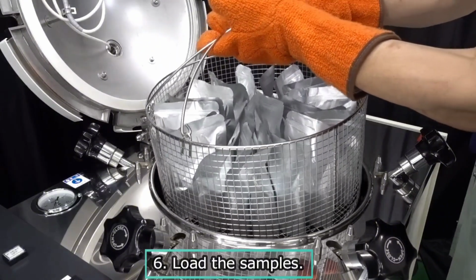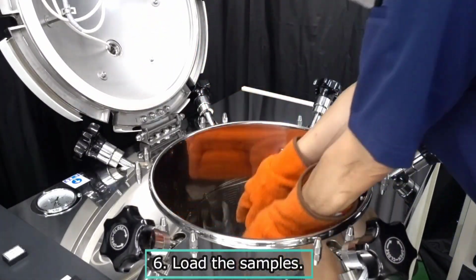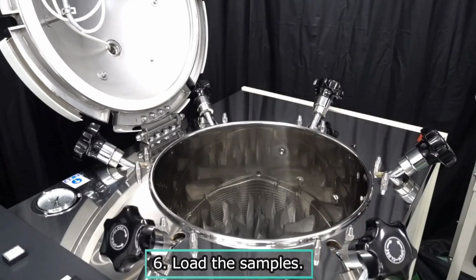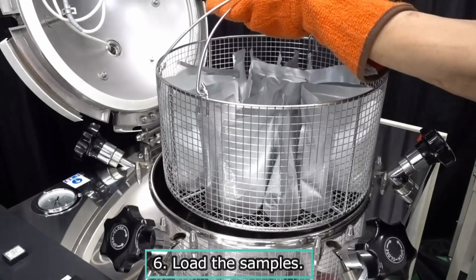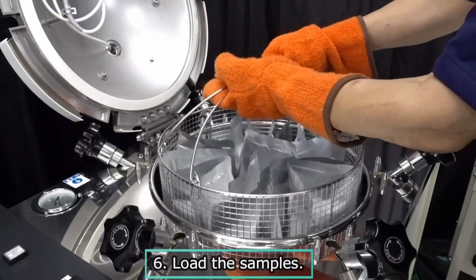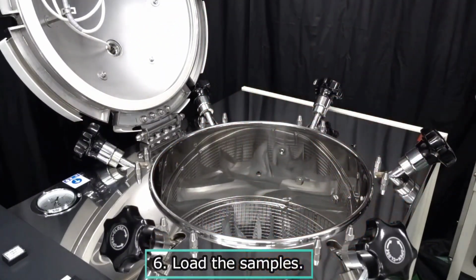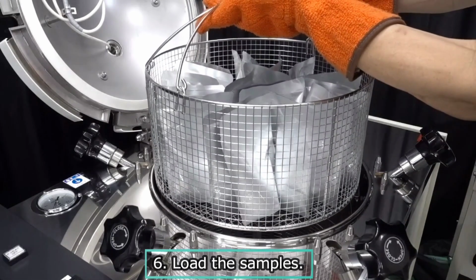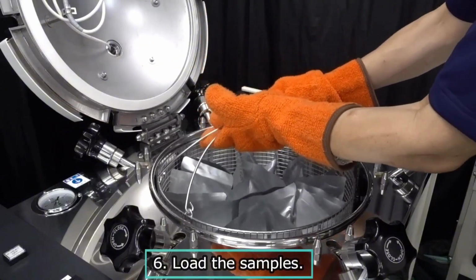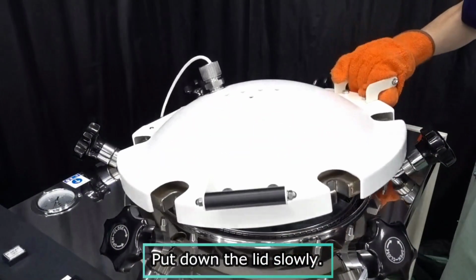Load the samples. Put down the lid slowly.